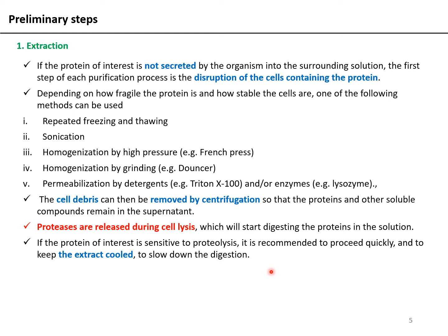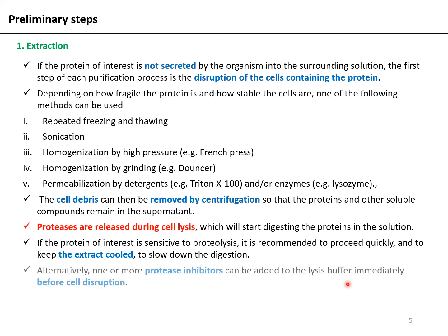So why is this done? This is done to slow down the digestion that would be otherwise caused by these released proteases. Alternatively, one or more protease inhibitors can also be added to the lysis buffer immediately before cell disruption.